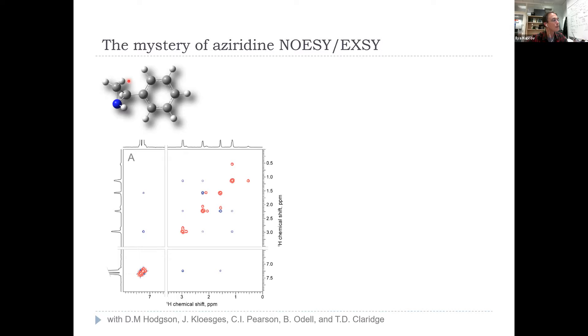So this nitrogen would invert itself and move this proton below the ring and above. She had the dominant species in there, so this is 1, 2, 3, 4, the four signals of the four protons on this aziridine. The tiny peaks in here are the trans species, the other one. She predictably saw, it's a tiny molecule in chloroform, negative NOEs because the sign is flipped on magnetization transfer in non-viscous liquids, negative ones for the distances, and then the positive ones for the chemical exchange between the cis, which is dominant here, and the trans, which is the minor.